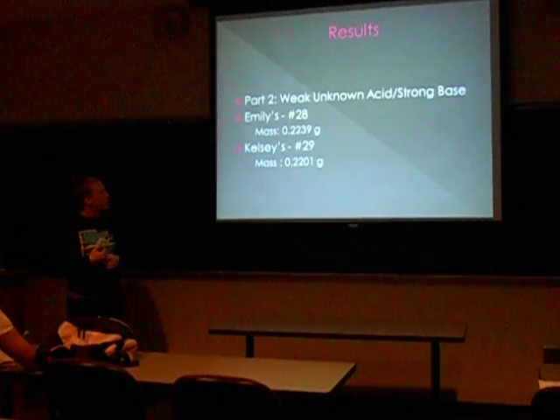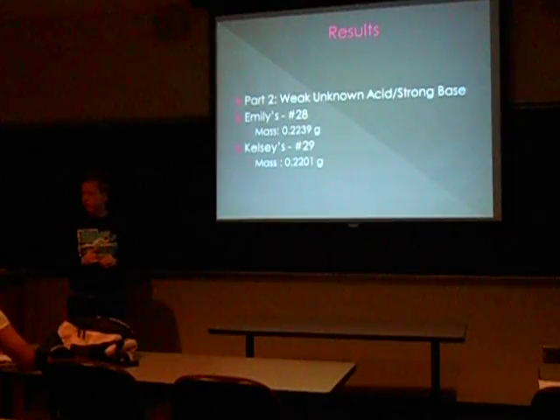For part 2, for the weak unknown acid and strong base, Emily's unknown, which was unknown number 28, the original mass was 0.2239 grams. And for the second unknown, which was unknown number 29, the original mass was 0.2201 grams.